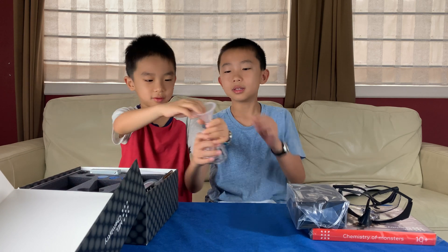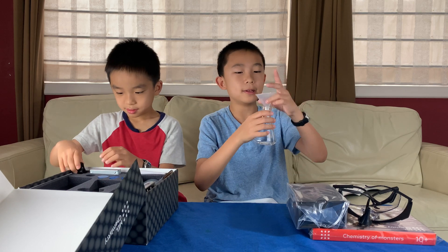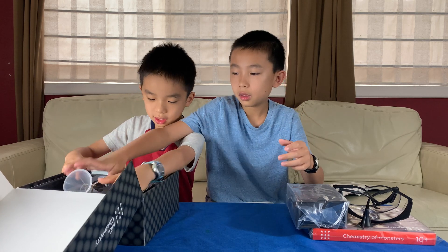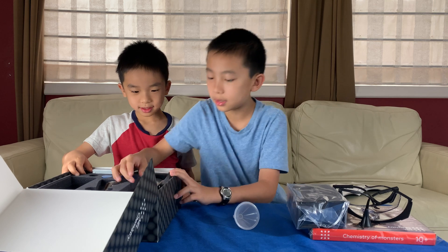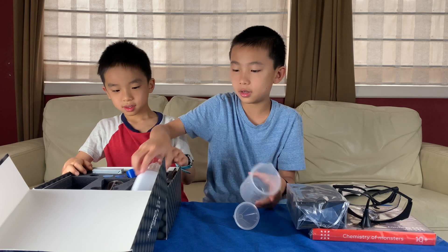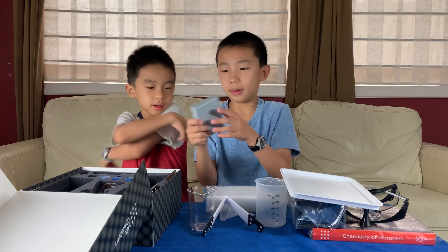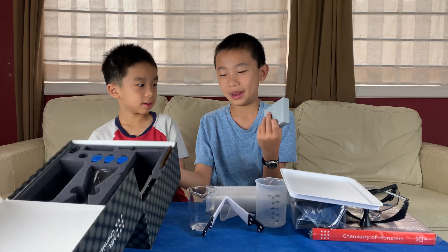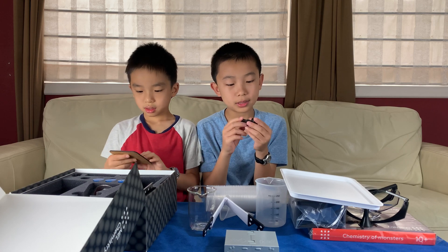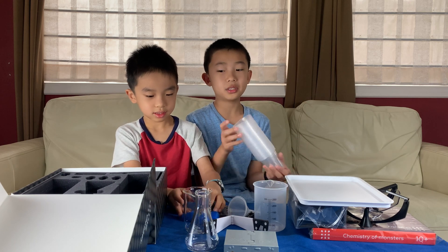This is a glass vial - or at least a vial - and this is what we'll use to pour things in. And a bunch of measuring cups - actually two measuring cups and a whole bunch of regular cups. There's also something that looks like if I drop it, it will break - is it a pocket stove? It's made of metal. And this looks like a macro lens.